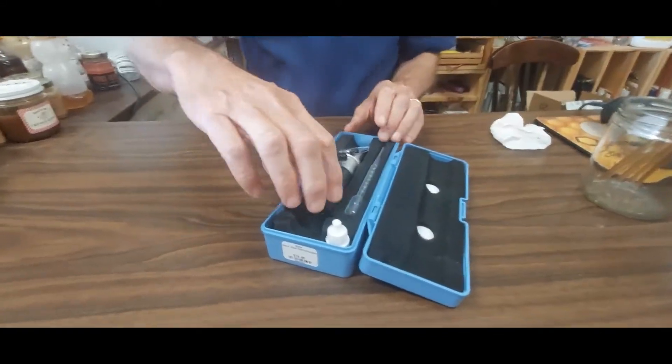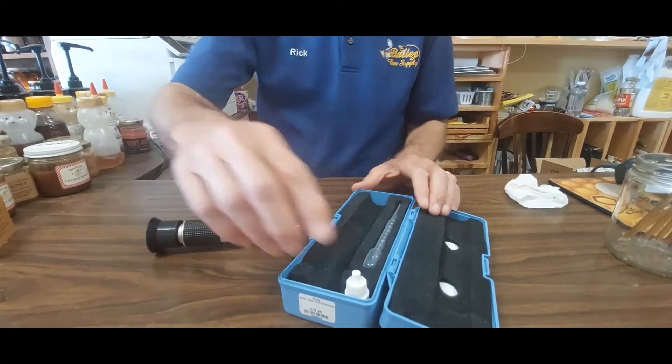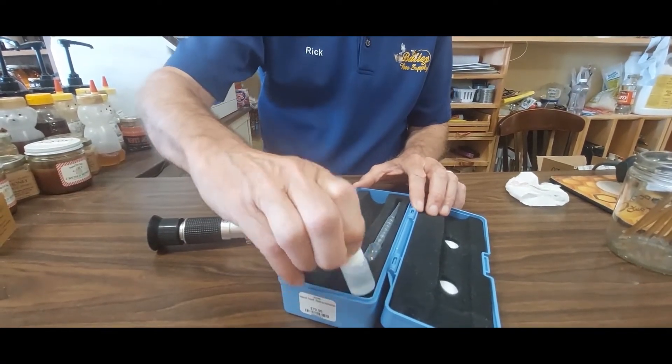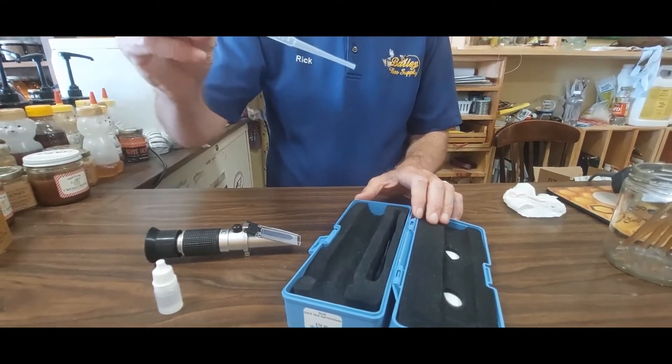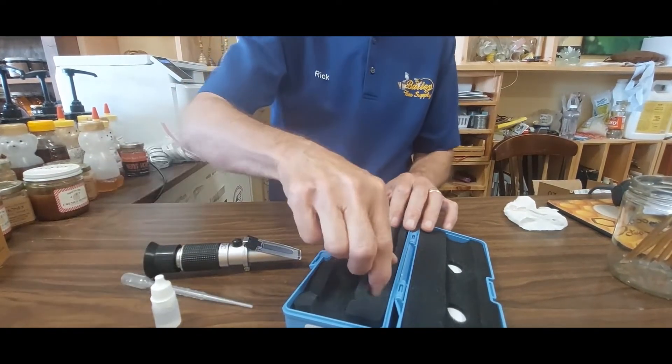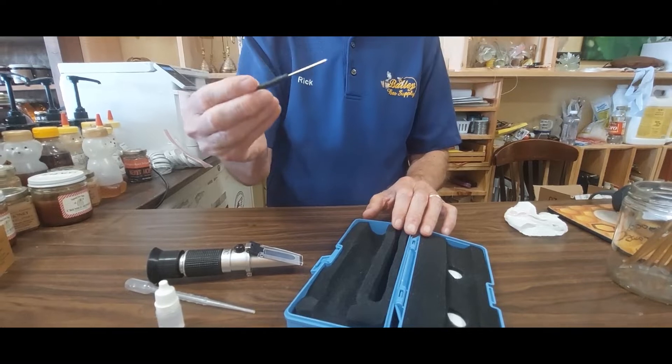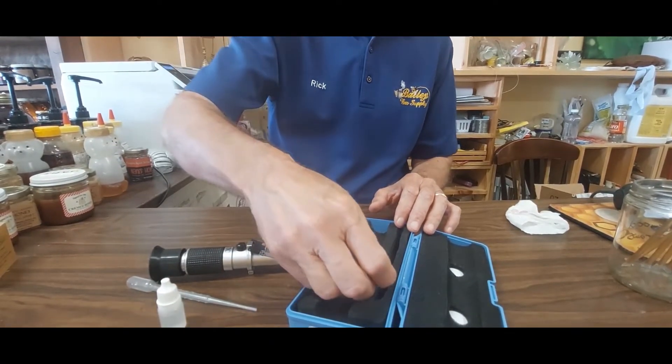We open it up and we have the refractometer. We have calibration oil, the dropper that you can use for transferring your honey sample to the refractometer, and a small screwdriver to change the calibration setting of the refractometer.